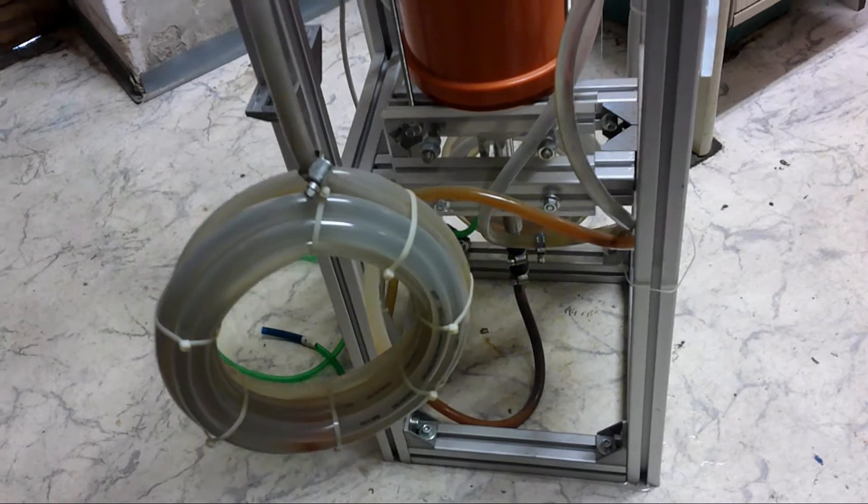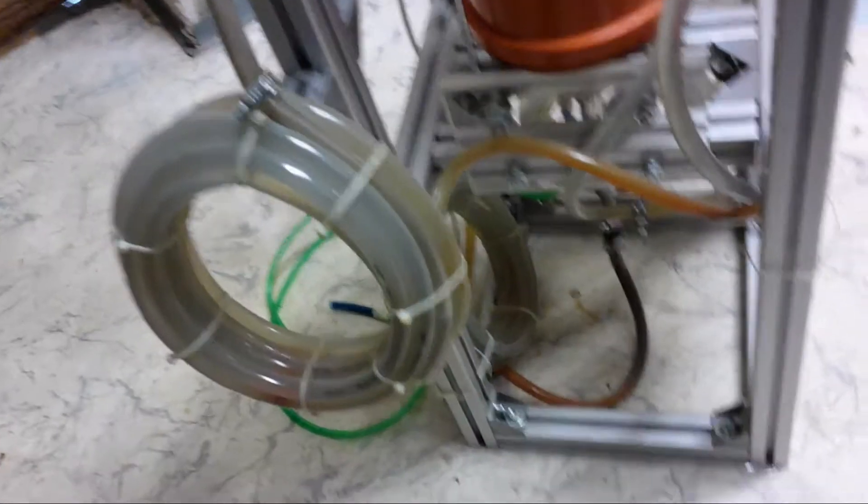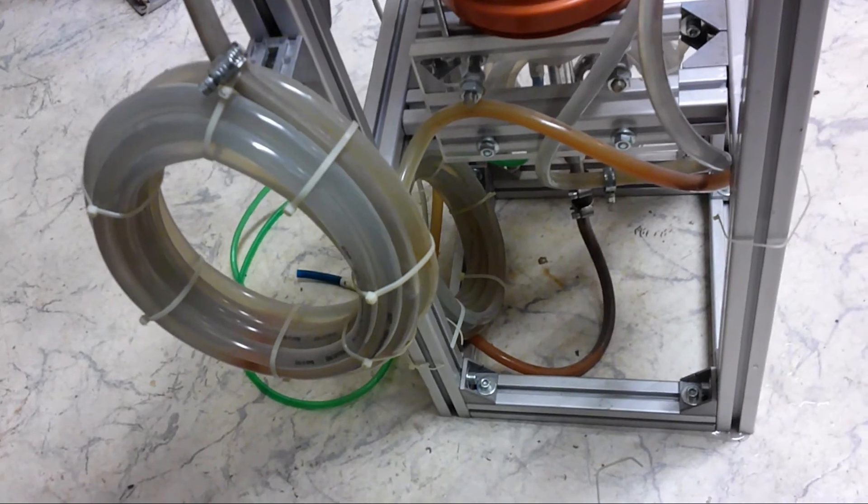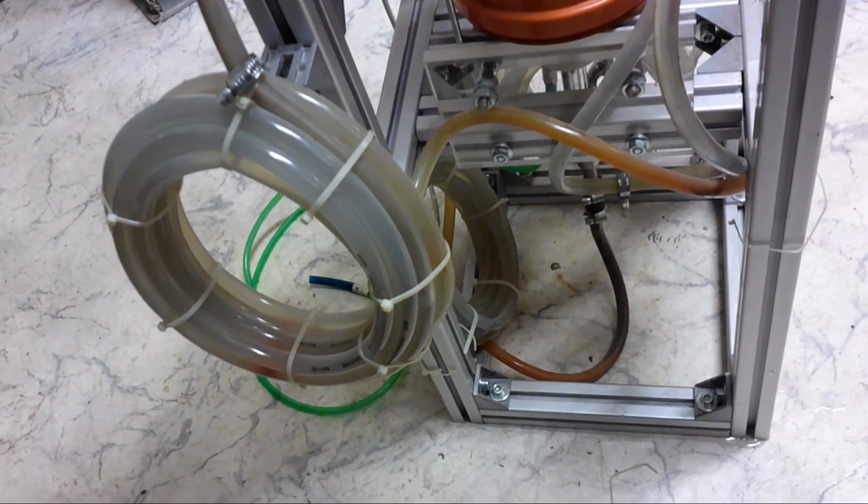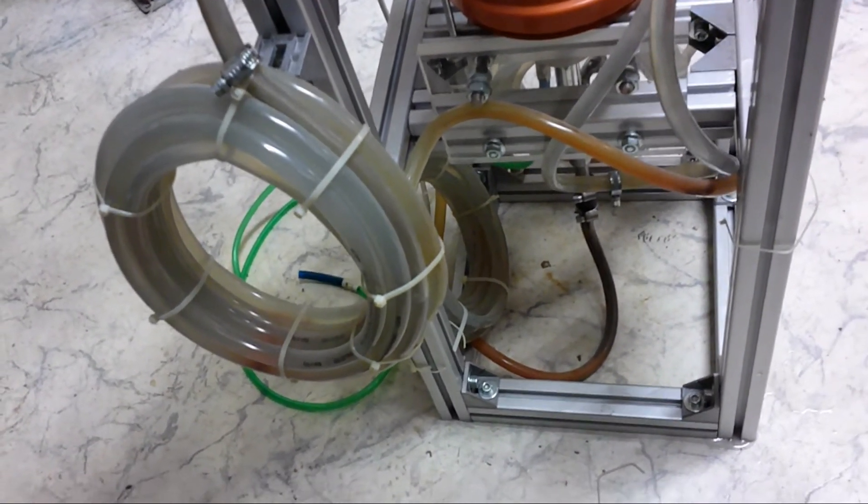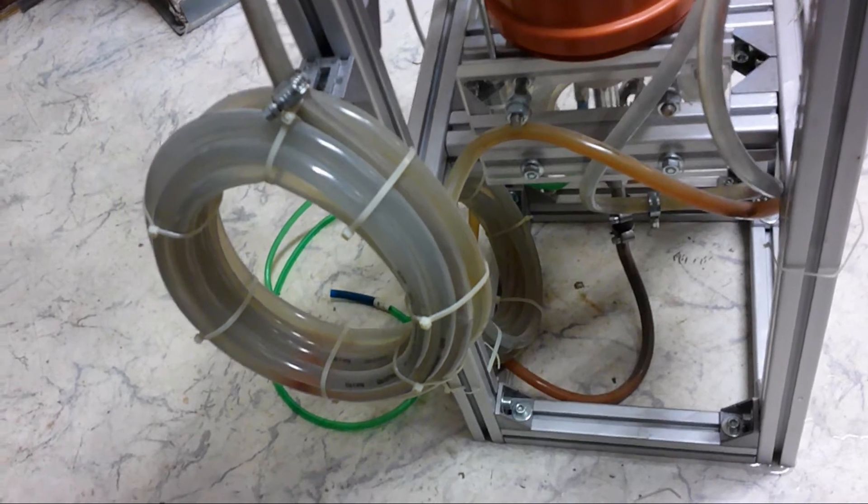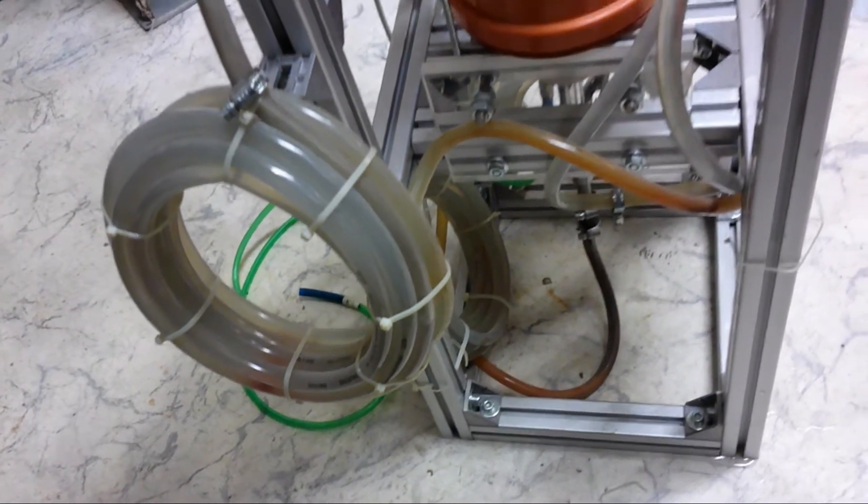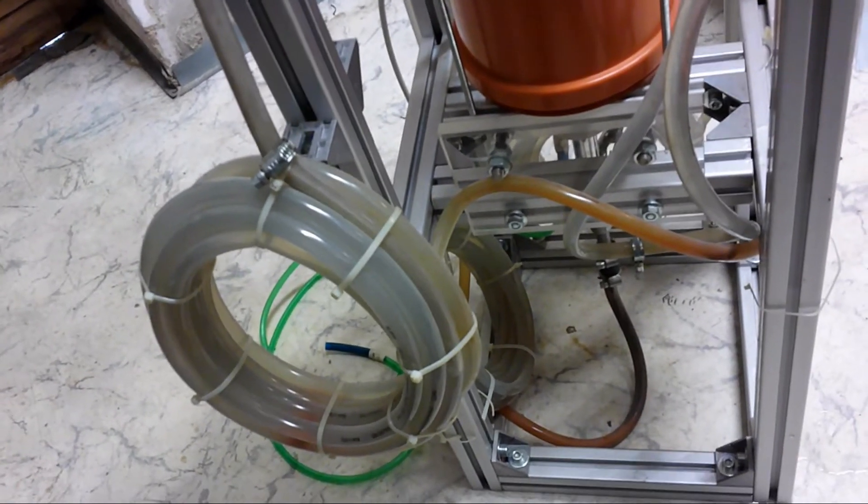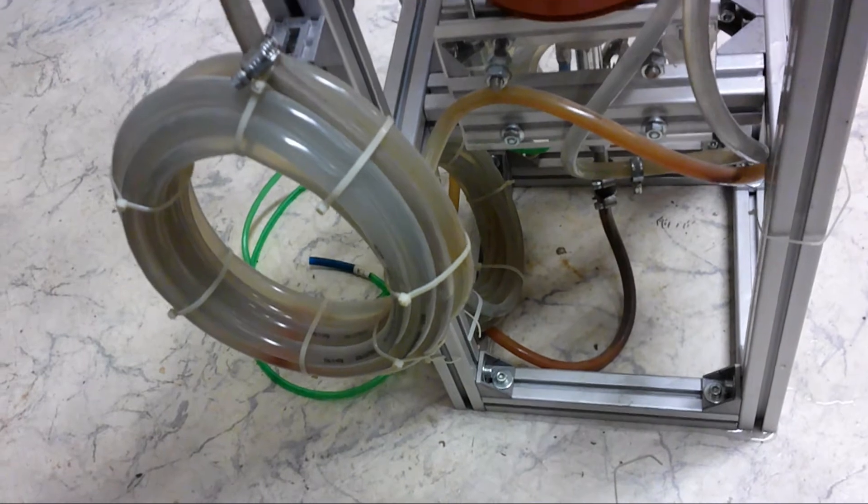You may ask yourself why I have used such a long tube here, why I made so many windings. As far as I remember correctly, I made this because I had actually the full high voltage potential across the whole water cooling system. So the long tube or the many windings is basically meant to increase the resistance in order to not have a big power loss from the shortage of the water cooling.